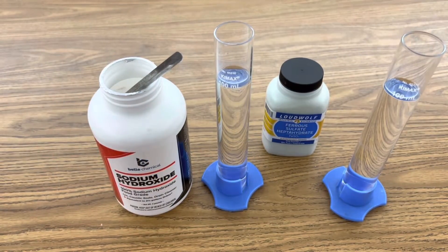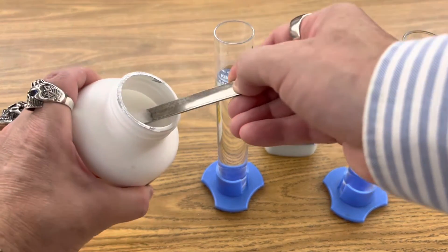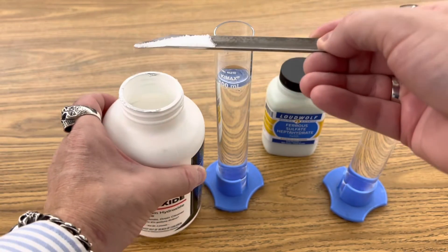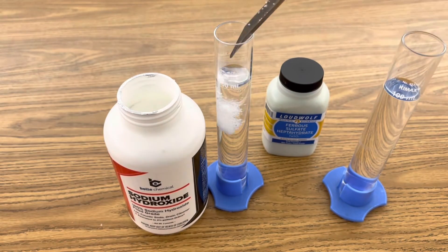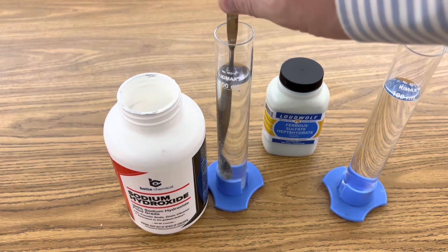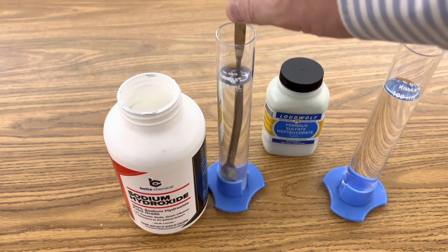Begin by creating an aqueous solution of sodium hydroxide by adding 4 grams to 100 milliliters of distilled water. Stir the solution until all your sodium hydroxide is completely dissolved.